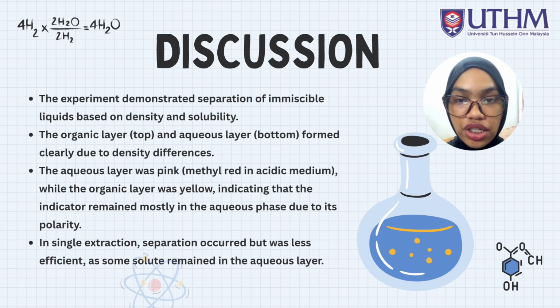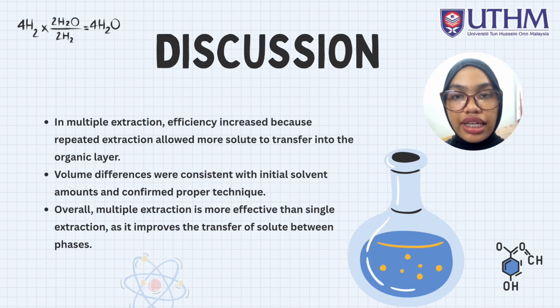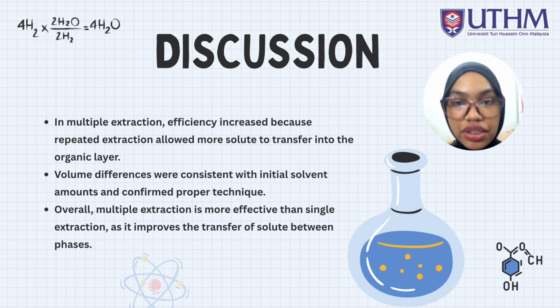In single extraction, separation occurred but was less efficient as some solute remained in the aqueous layer. Next, in multiple extraction, efficiency increased because repeated extraction allowed more solute to transfer into the organic layer. Volume differences were consistent with initial solvent amounts and confirmed proper technique. Overall, multiple extraction is more effective than single extraction as it improved the transfer of solute between phases.